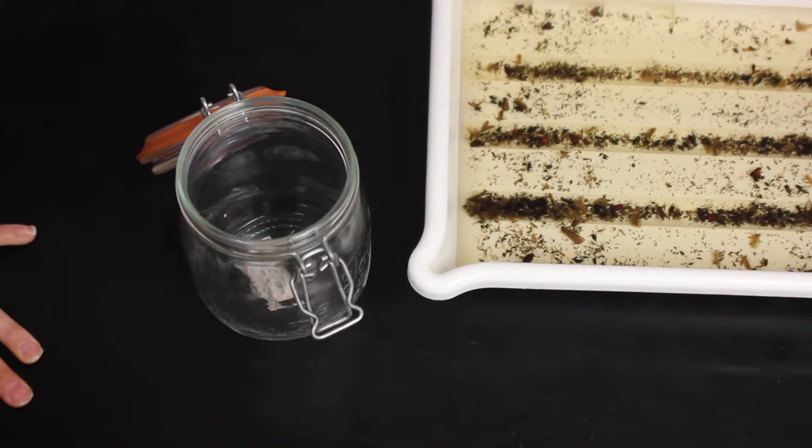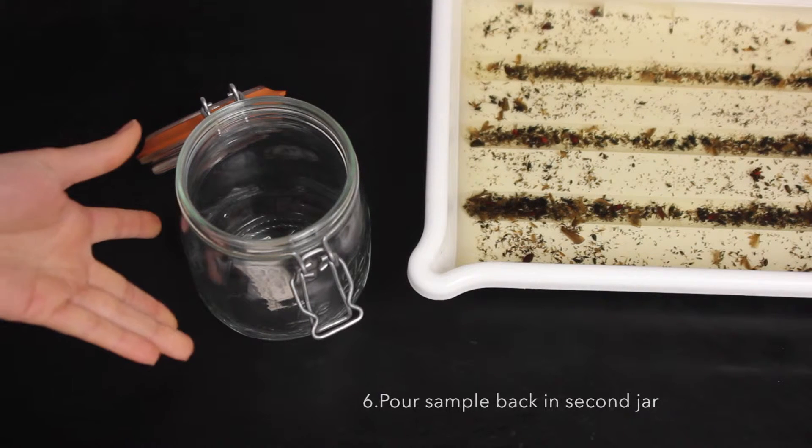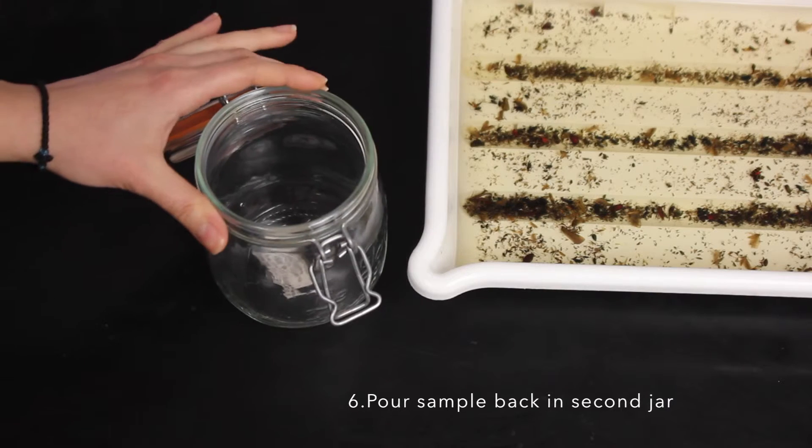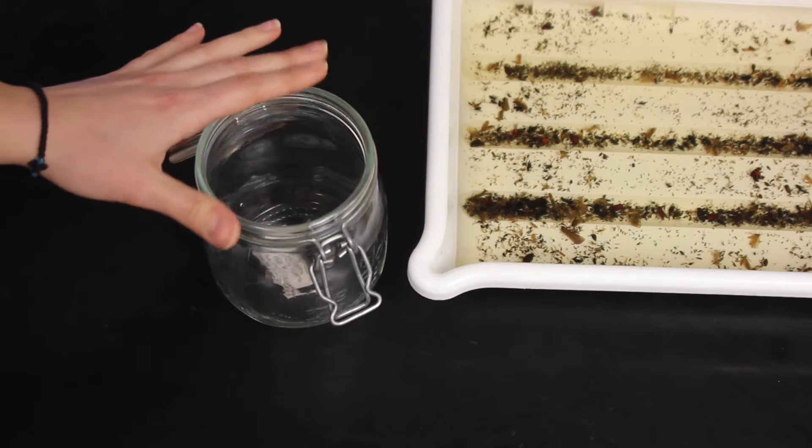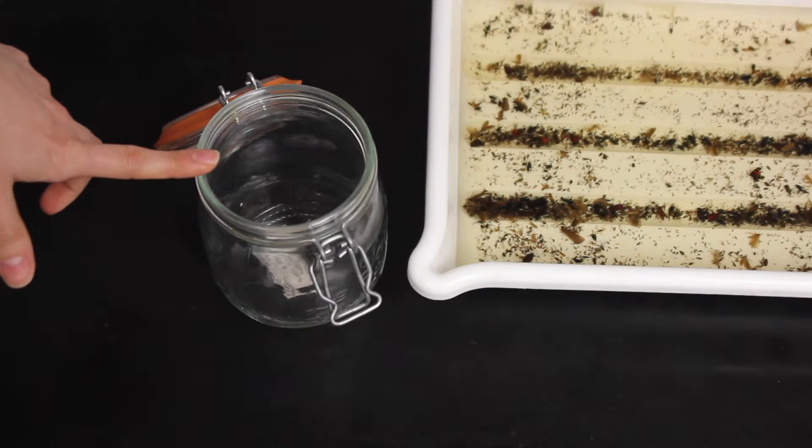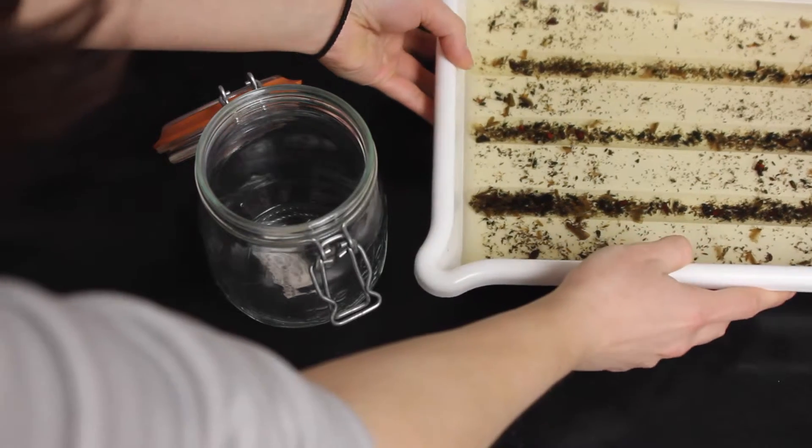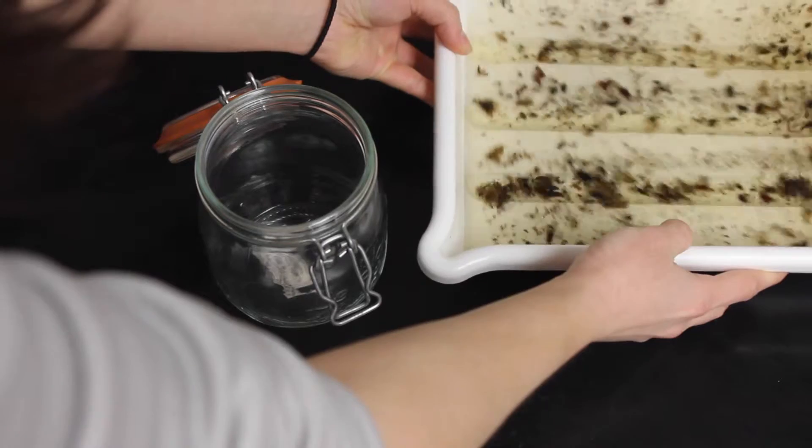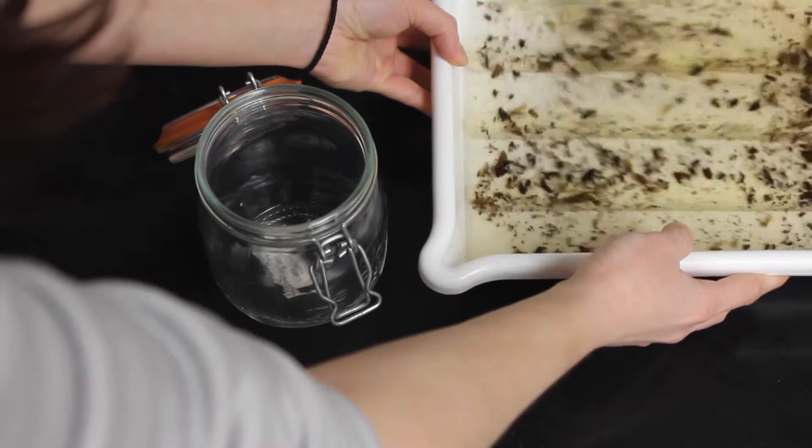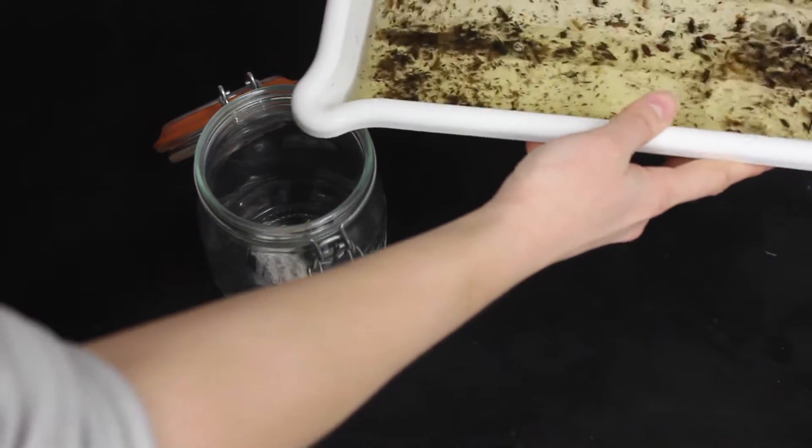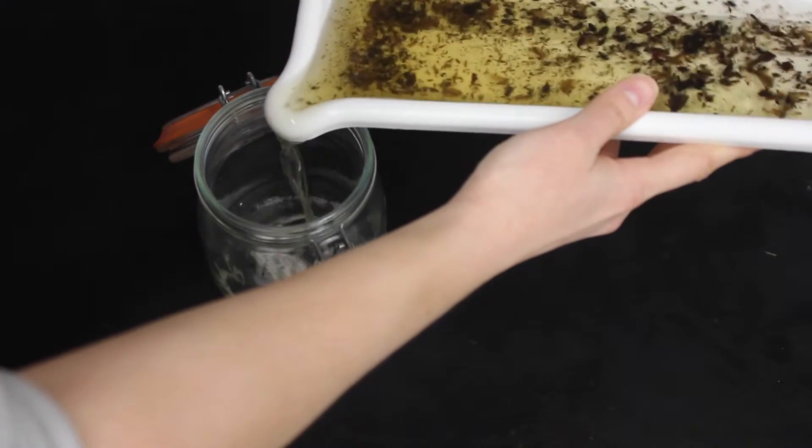Now only the small sized specimen remain. We need to pour them back into our bale top jar. And for this we use our clean bale top jar that contains the internal label that we placed in earlier. And to do so, we're going to pick this up, give it a swirl, and pour it in slowly.